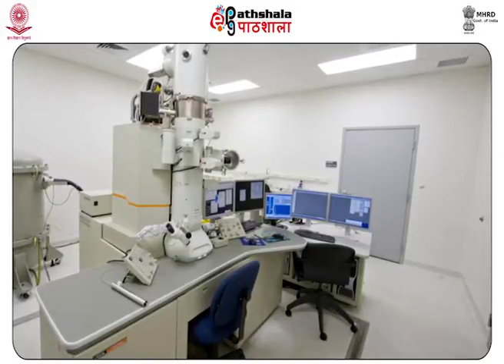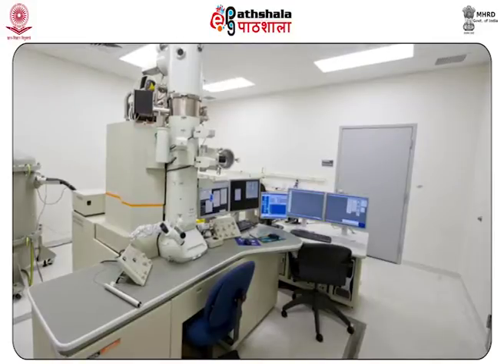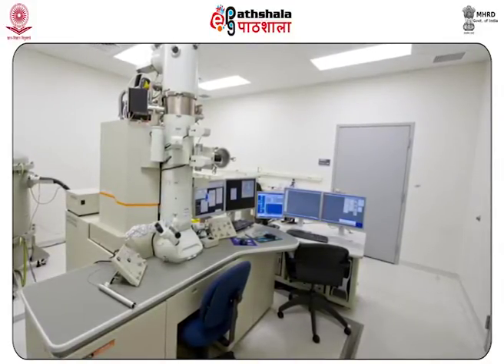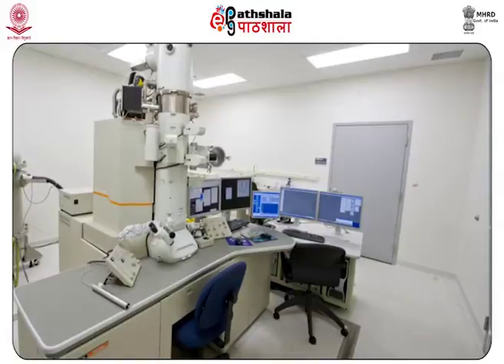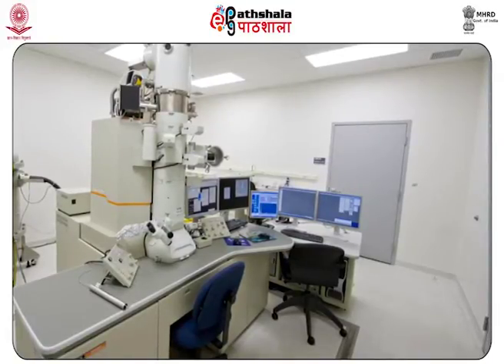In addition, on striking the sample, the electrons give up some of their energy to the elements present in the gunshot residue. Now, this energy produces X-rays, the wavelength of which is characteristic of the element present.